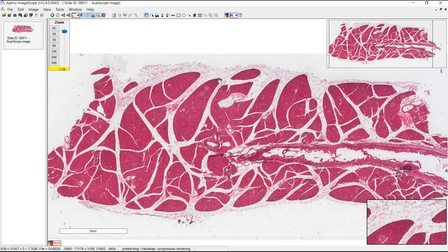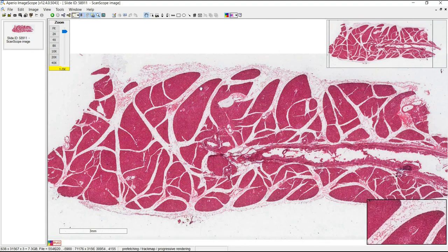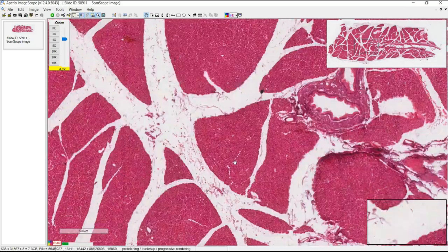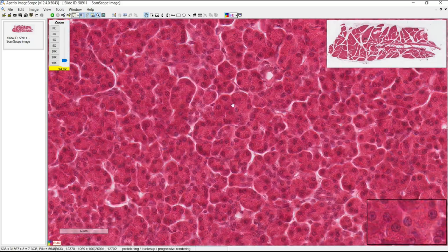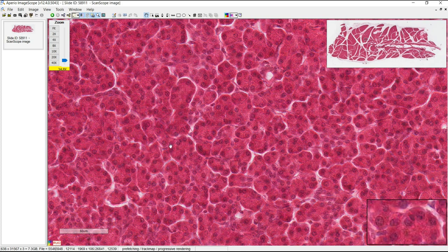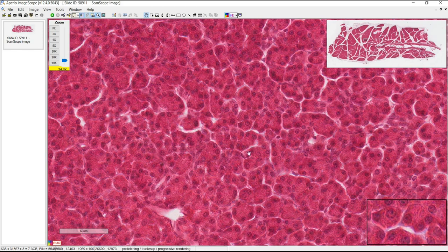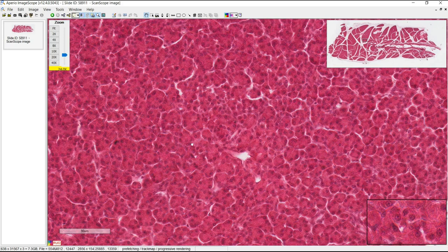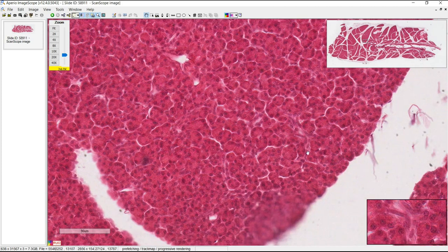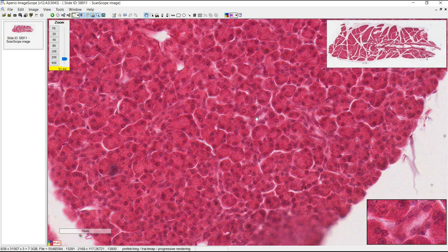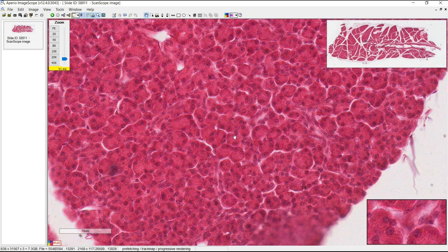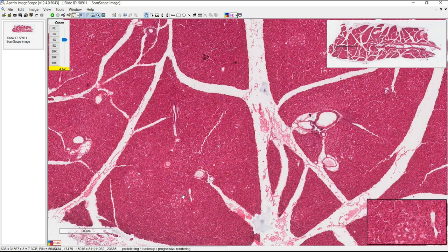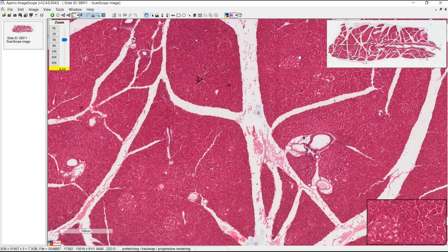Here's another slide of the pancreas. I actually like the other slide better because there's more color contrast, but here you can still see it separated into lobules surrounded by connective tissue. On higher power, each one of these are the serous acini. The central acinar cells are a little harder to see due to less contrast, but you can see some ducts here. The islets are also a little harder to see, but you can make out these circles with lighter staining cells.